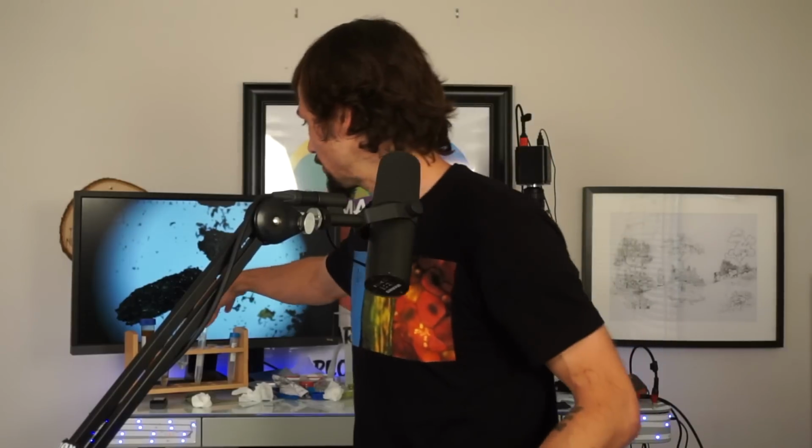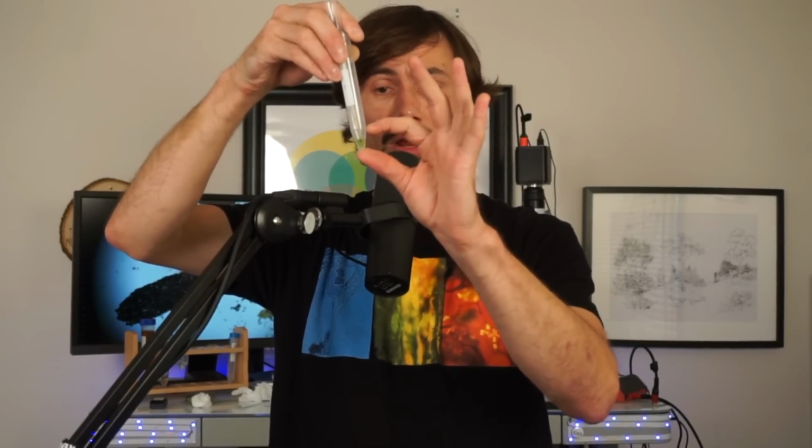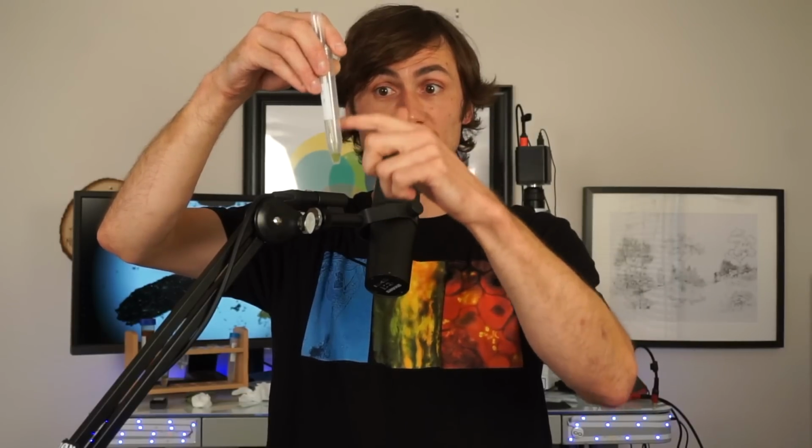And that's simply because they take one of these test tubes. I was doing some plant material in here, plant sap. That's why it's green. But they fill the soil up to here in it. I'll do a picture. And then they tamp it down so there's no air. And then they fill it up with water, or they fill it up with water and then add it to the next, like 1 ml worth. They displace it 1 ml and then add the water to the rest.